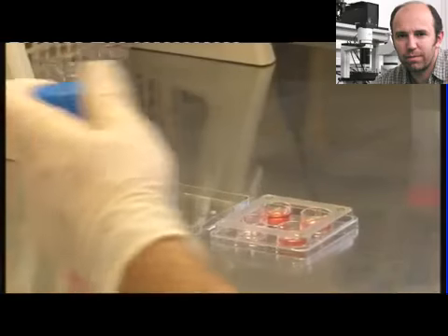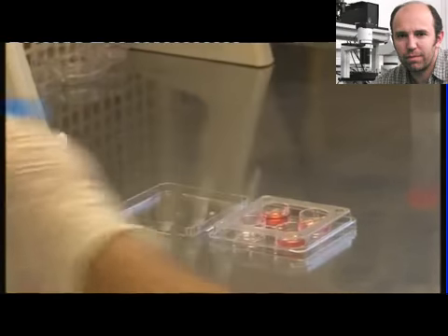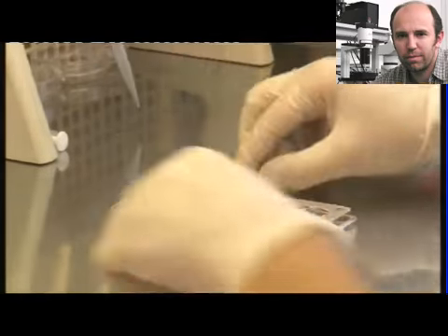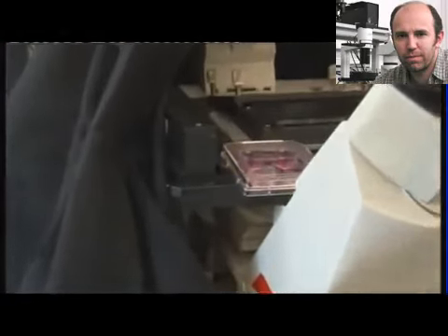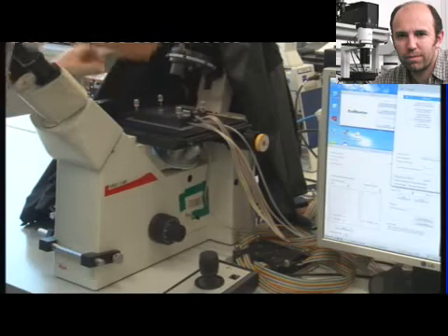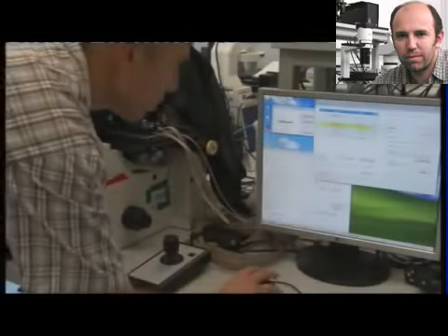The cell cultures were grown in DMEM culture medium supplemented with bovine serum in culture plates kept in a standard incubator, providing for optimal temperature, humidity, and atmosphere. Cell movements within cultures were recorded by an automated microscopy setup, which monitored parallel cultures for several hours up to a couple of days. We placed the cell culture plate into a transparent mini incubator mounted on the powered stage of an inverted microscope. The stage-top incubator provided for standard cell culturing conditions.